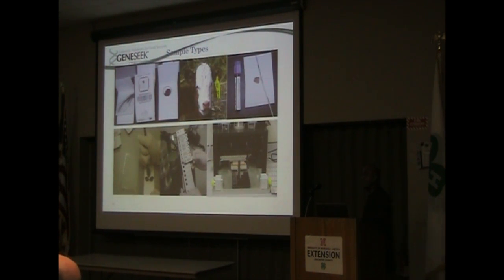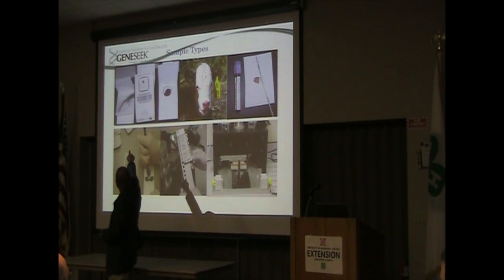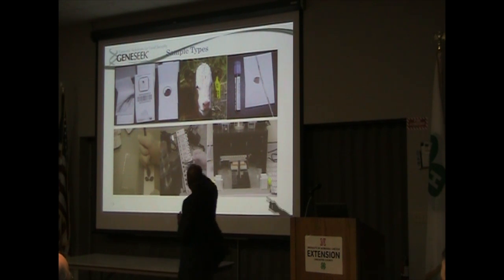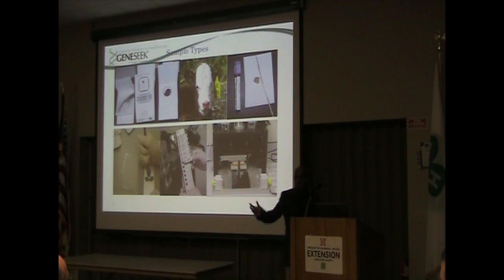So what all sample shows up at the company? You name it, anything that you can think of that you can get a piece of DNA out gets mailed to us. Hair on cards, these two type of cards we call the middle, those are actually nasal swabs. Very affectionately referred in the lab as booger samples. And then those are blood cards. You can put semen on there, so we get semen also spot on those cards. We get ear tags, straws of semen, ear notches, blood, you name it. If we get ear tags, we have a machine that we just simply array those tags into, stick it into the machine, and it punches you those ear tags straight into a 96-well plate.